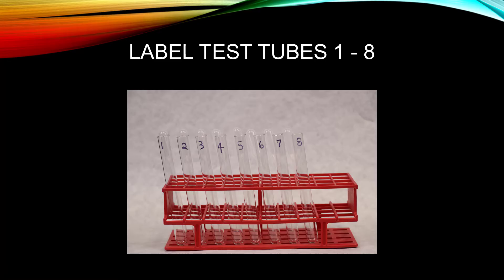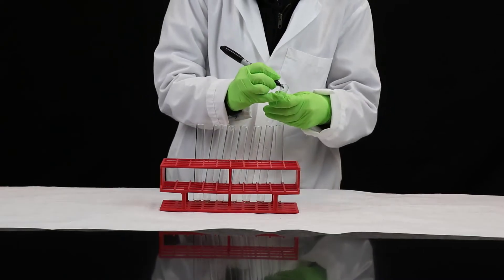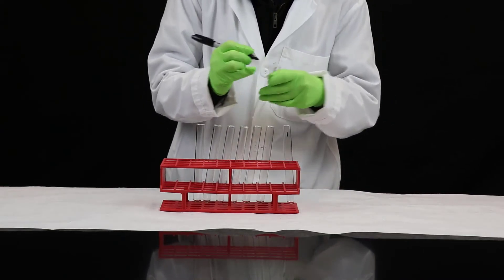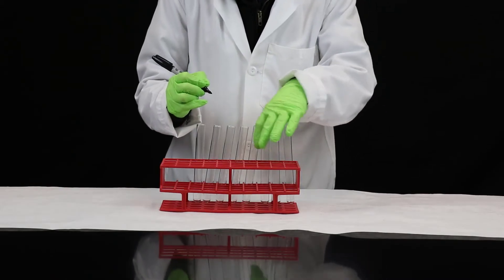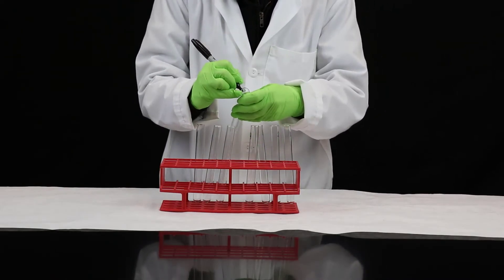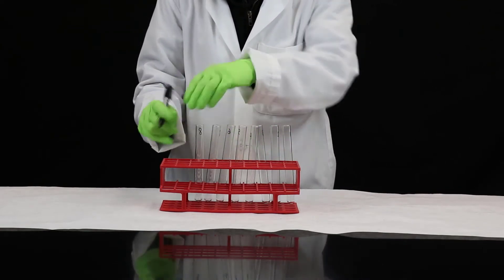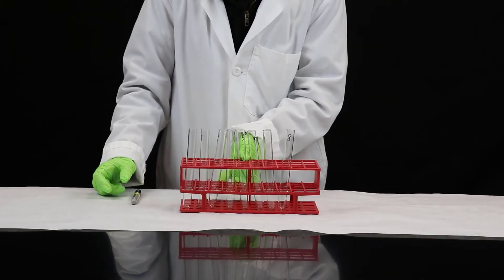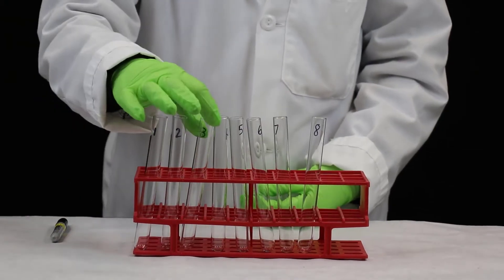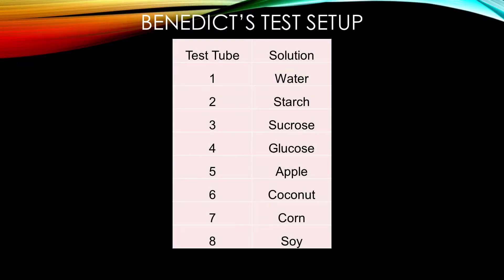Label your test tubes one through eight and place them in the test tube rack. Here is the table of solutions we will be using: 1. Water, 2. Starch, 3. Sucrose, 4. Glucose, 5. Apple Juice, 6. Coconut Water, 7. Corn Juice, 8. Soy Milk.